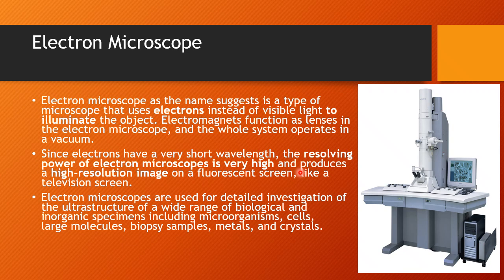Apart from the high cost, they also have very complex maintenance. They need specialized infrastructure, and special training to handle this microscope. Because of all these, we don't use them very commonly.